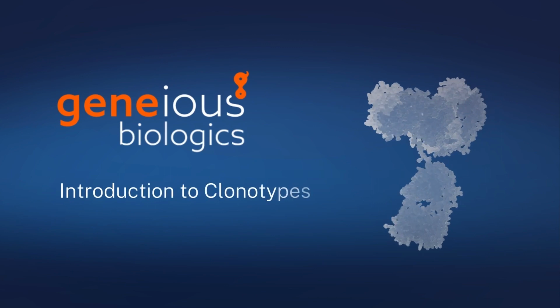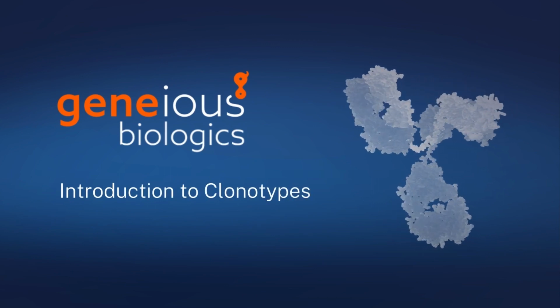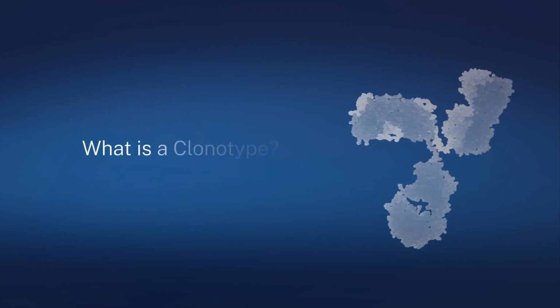Welcome to this Geneious Biologics video on clonotypes and how researchers use them to monitor clonal expansion and identify antibodies with high binding affinity.